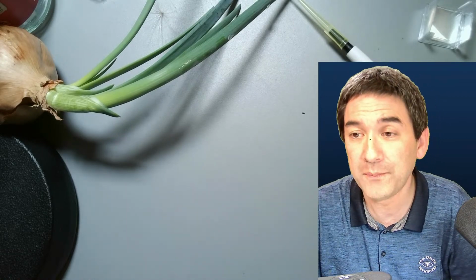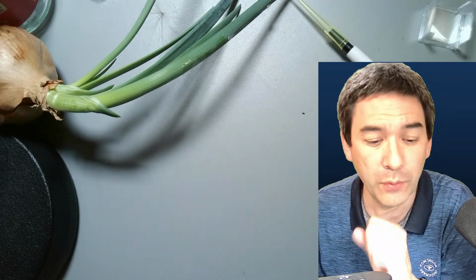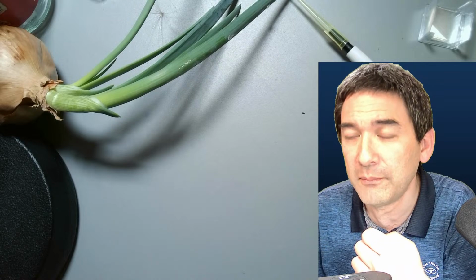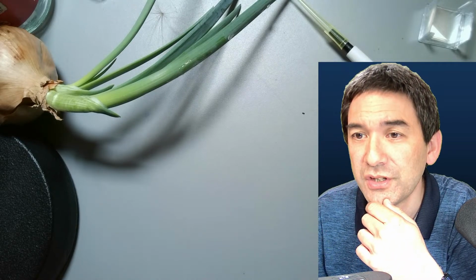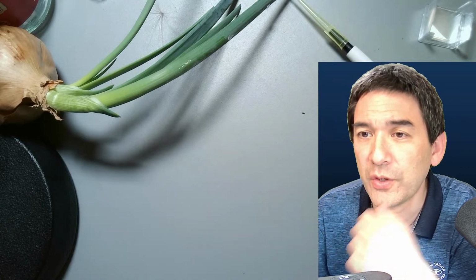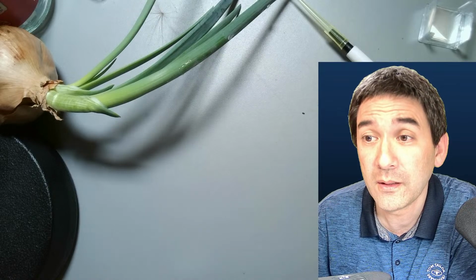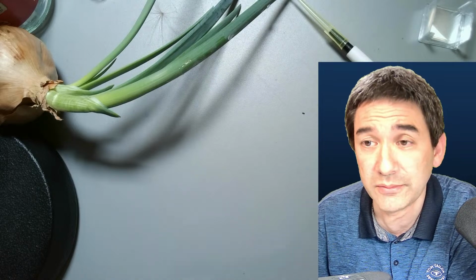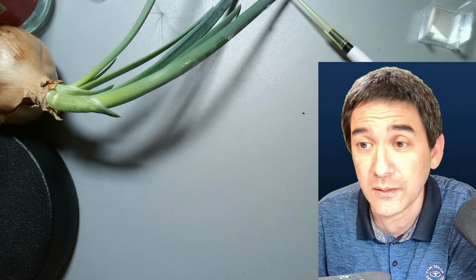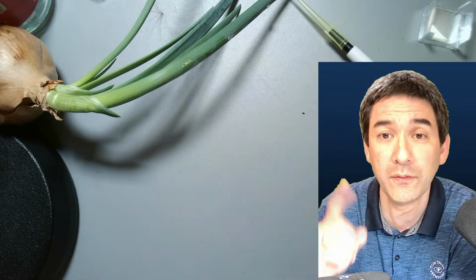Okay, before I move on to the next topic, I do quickly want to answer some of the camera related questions here. There's a question about the Amscope T490 by Jesse. Sorry, I don't know this microscope. You have to try it out, okay? Camera is overexposing. Yeah, that's probably because of the dots.